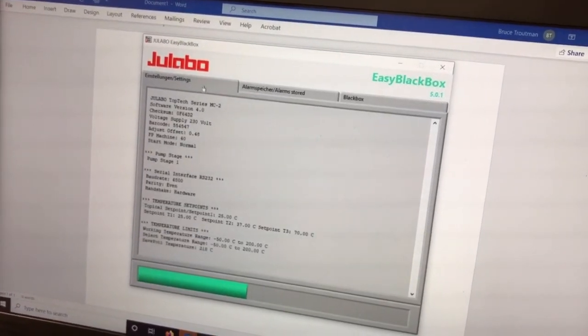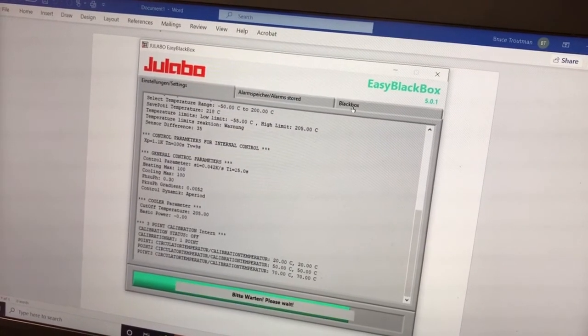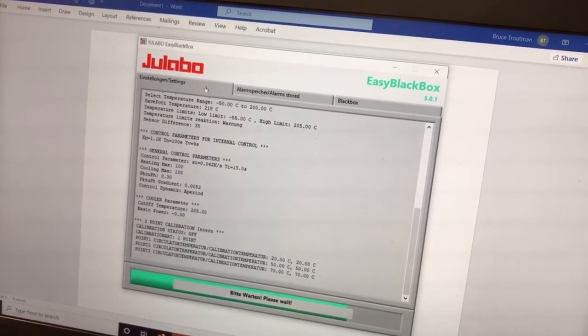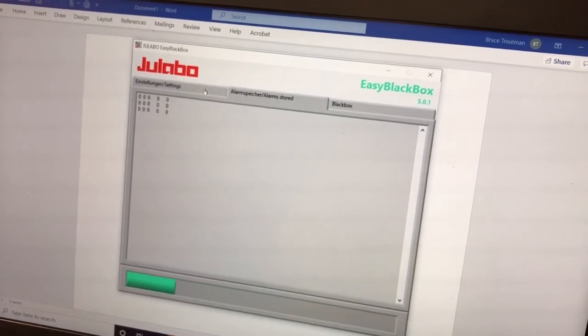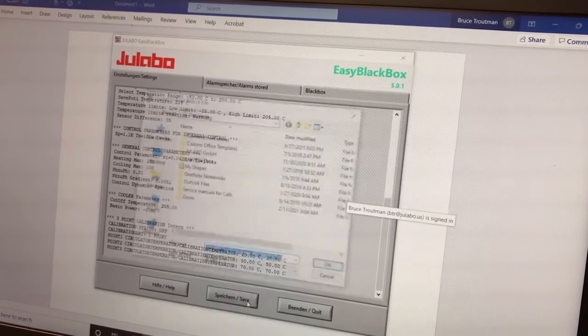Next you will click the OK button, and this will automatically download the settings, the alarm stored, and the black box, eventually resetting to the settings. From there we will proceed to save the file. Downloading has been completed — now we will click Save File.